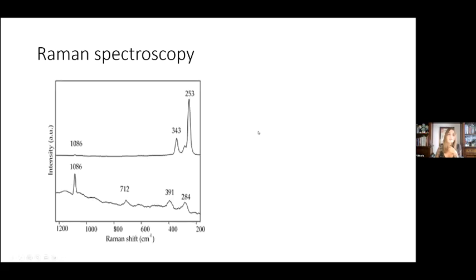Moving to Raman analysis, non-invasive measurements were carried out by both a benchtop micro-Raman spectrometer and a Raman portable device equipped with a fiber optic probe. The presence of the previously mentioned cinnabar on both bright red samples was confirmed. In the upper part of the figure, its characteristic spectrum is shown. The lower spectrum instead refers to the yellow sample and indicates that yellow ochre was used.